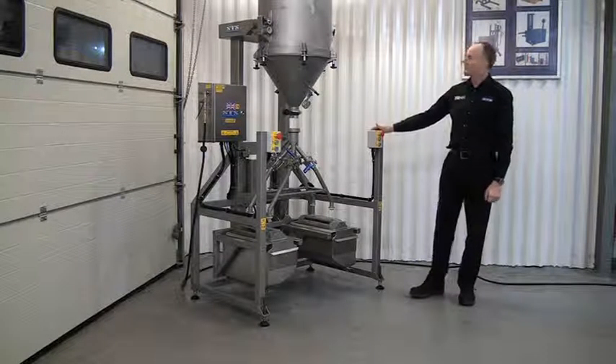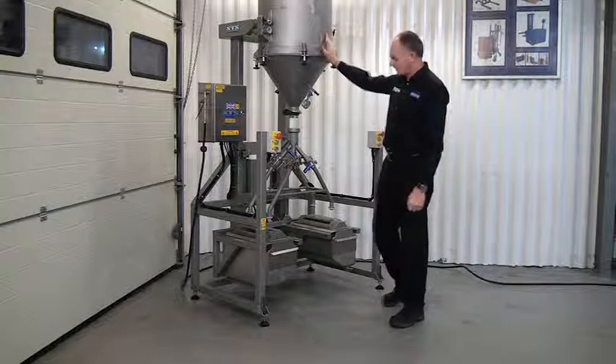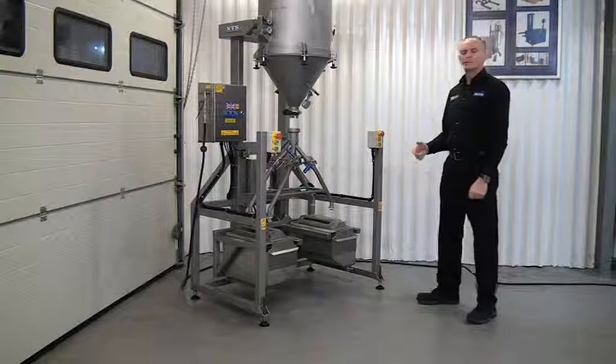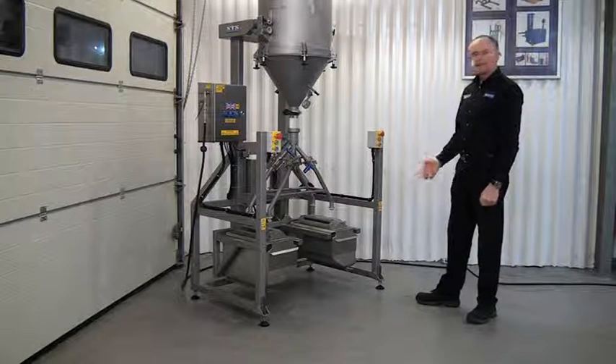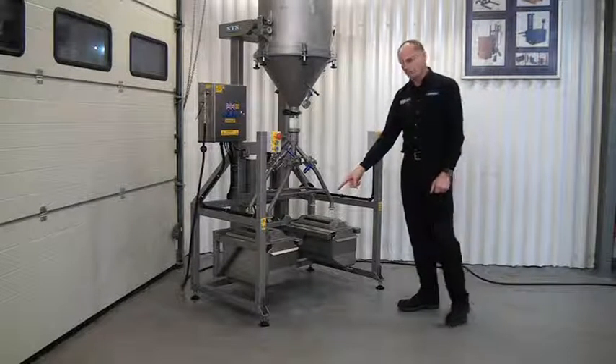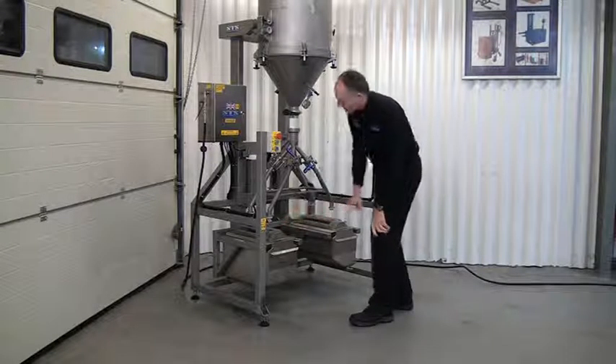This unit has been designed to load titanium powder from this unit here into these two hoppers you can see at the bottom. When the unit's in production, a lifting unit will bring the two hopper tanks along and actually slide them on these two rails into this position.